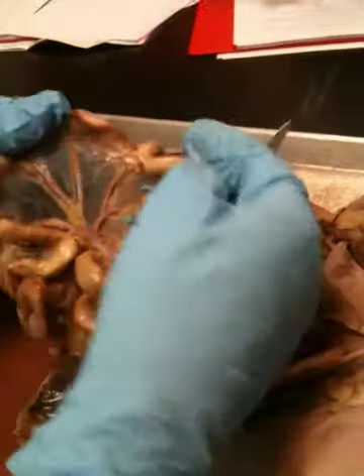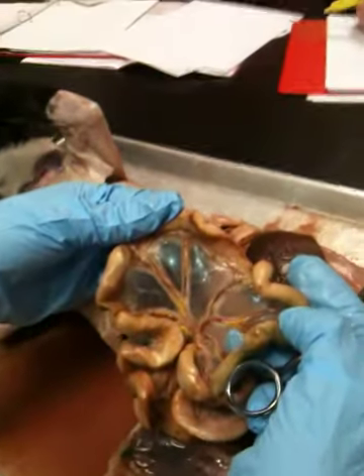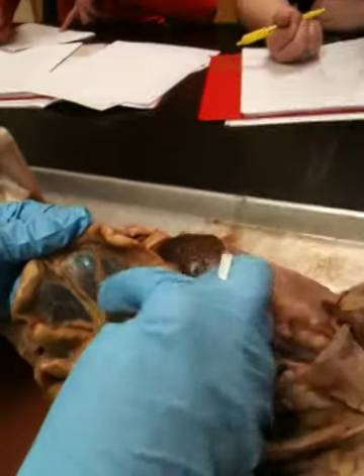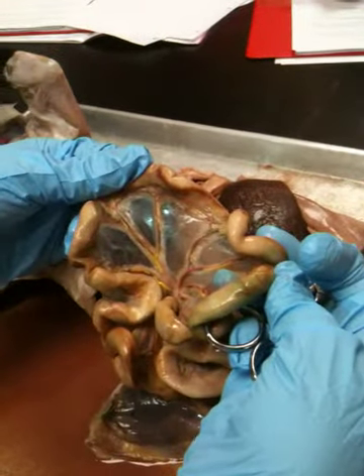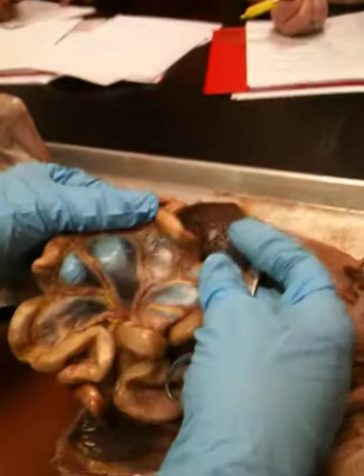Okay, and all of this stuff that's holding the small intestine together and pinning it to the posterior body wall, this is all mesentery. The mesentery is actually a component of the visceral peritoneum. It has all the blood vessels. See, those are all the blood vessels in it. All right, so this is all ileum.